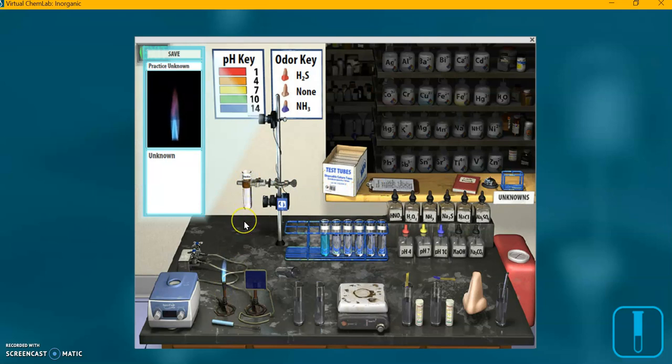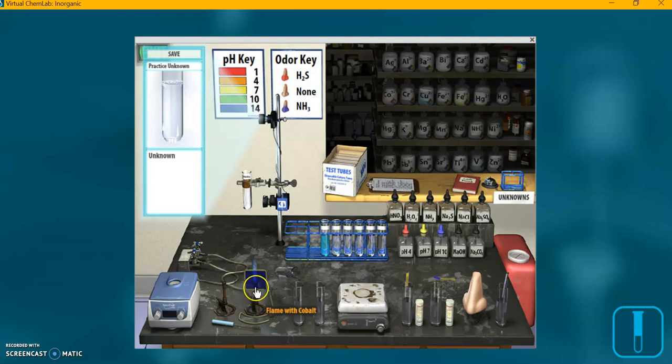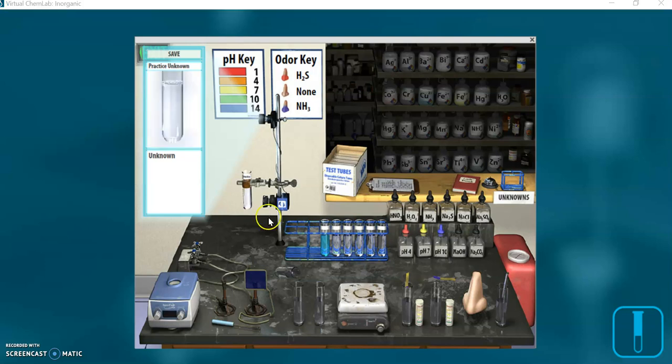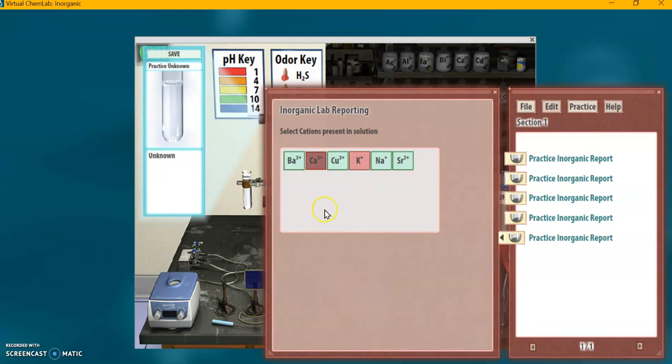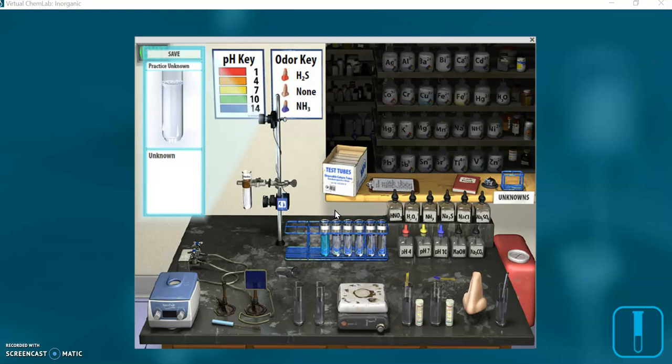Let's see what we have here. Let's try the cobalt. Oh, nope, that was wrong. Looks like it was potassium again. So don't forget to write in your data sheet your four guesses for the four practice unknowns, and you have a couple questions at the end of your Beyond Labs sheet to answer. And that's it for today.